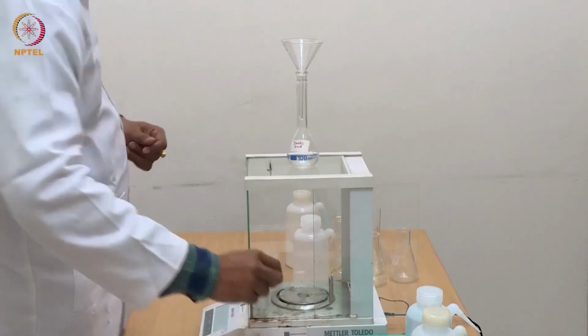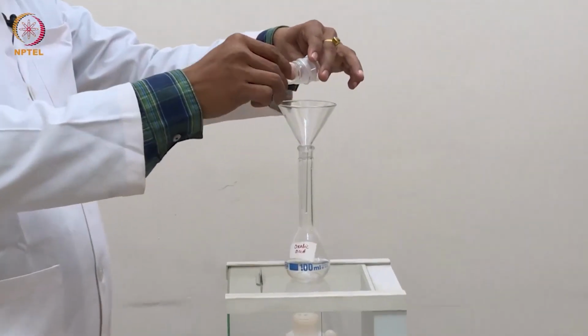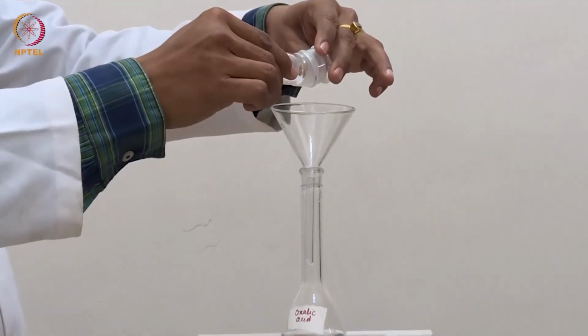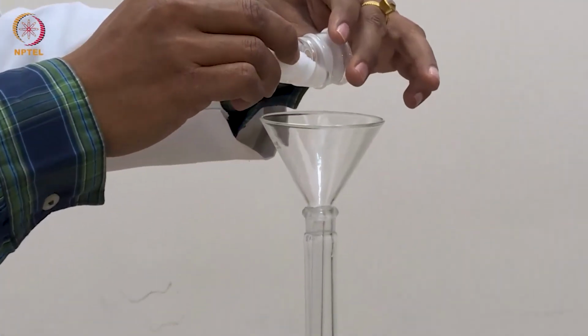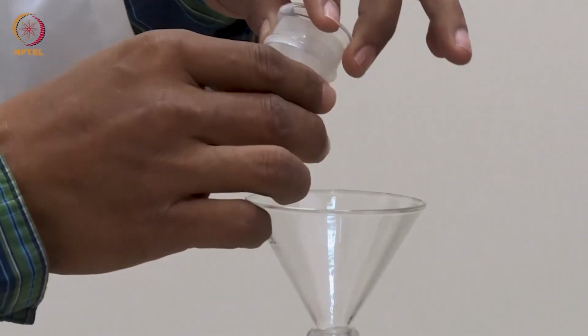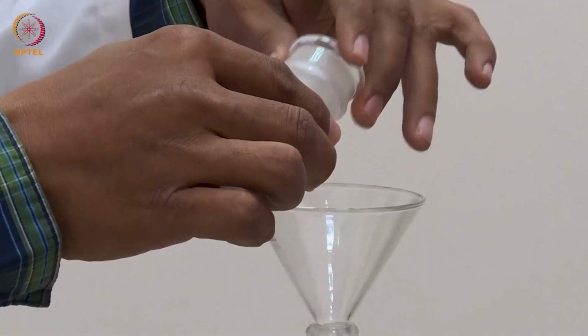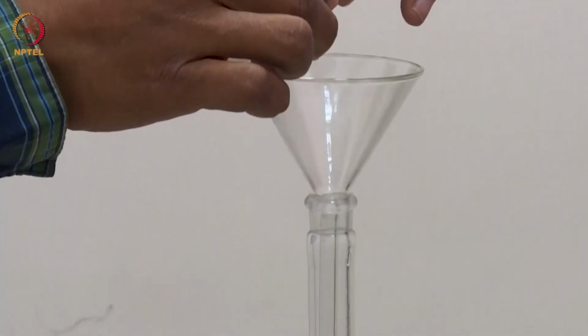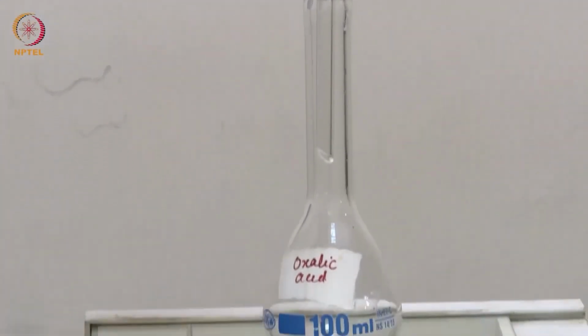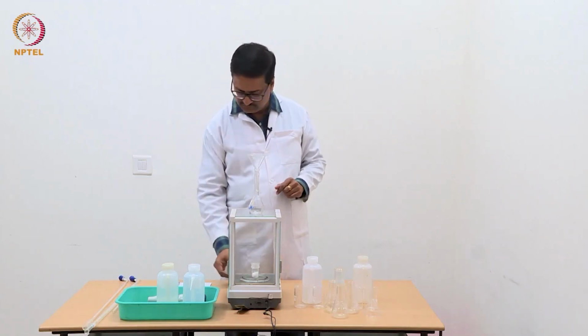So we should again take it back and transfer a little more oxalic acid to this volumetric flask carefully and cover it with the lid, making sure that no drop or no particle falls outside the funnel, and take it down in this one.